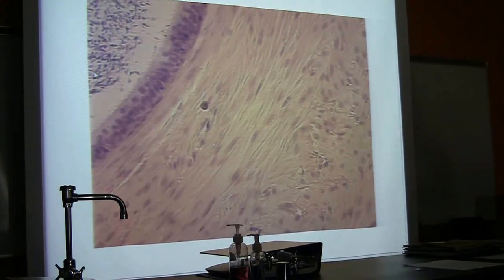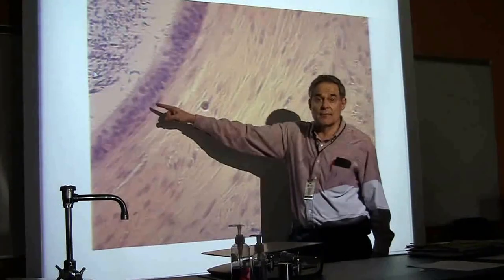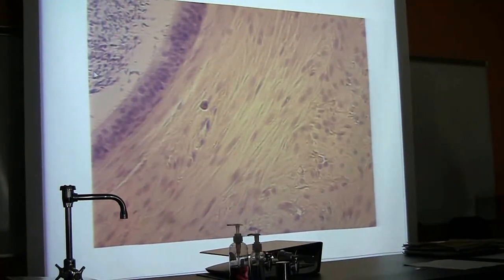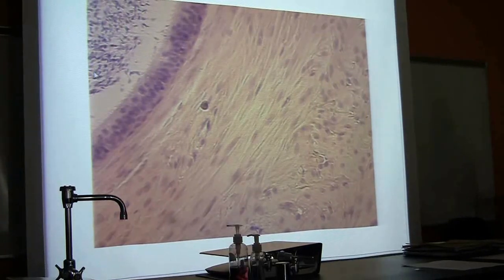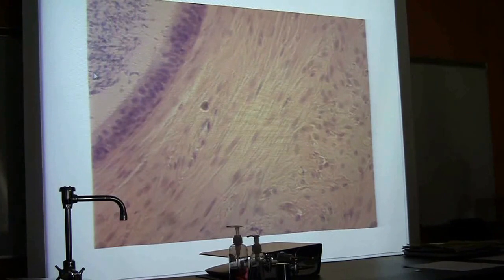Again, it's the contraction of that muscle that moves the sperm, not the stereocilia, which are microvilli. Any questions on the difference? Again, function: stores sperm temporarily, site of sperm cell maturation.